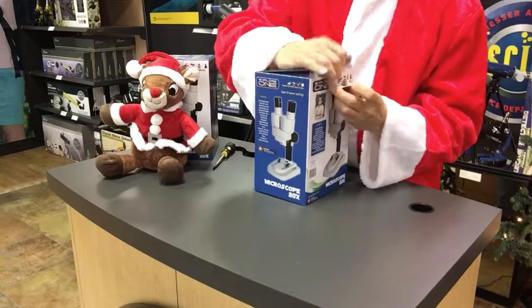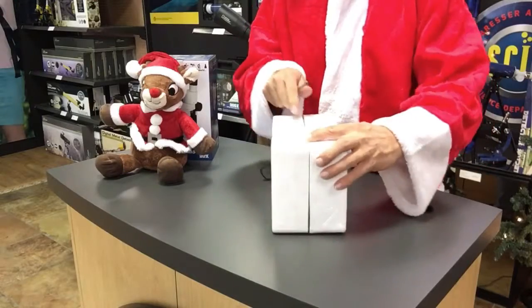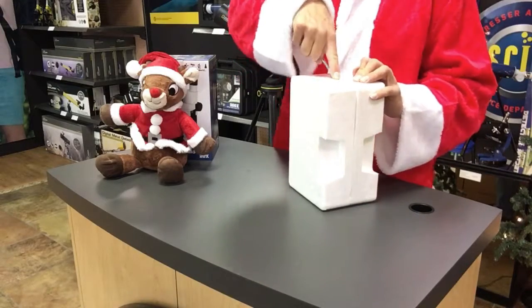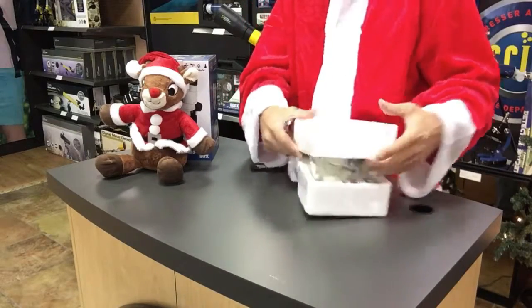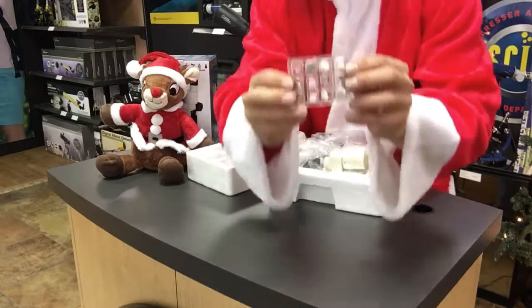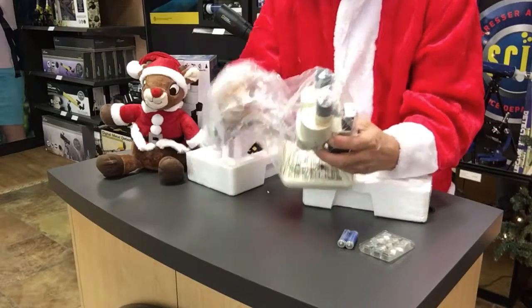We've got a little flap here and a flap here. Just turn it upside down and you can shake it out. There's tape all the way around here, so you can use something with a sharp edge — be careful that you don't cut yourself, you don't need something really sharp — and it will open up. And there it is. You've got cool specimens in here, some cool rocks, and it comes with two AA batteries, and a microscope, and it's already assembled. So this is going to be easy.